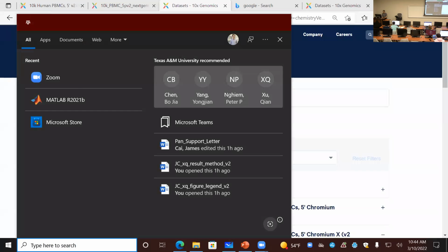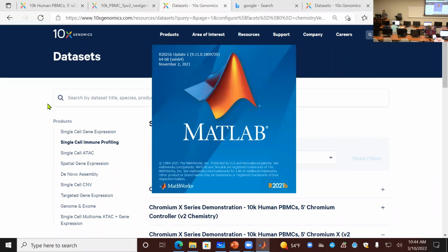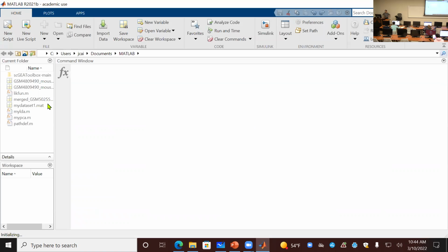So I will show you an example of what you can do if you have data like that. Once you have this data, you want to show it in your scatter plot and label different clonal types in different colors, and see which color is more frequent and where they are located.